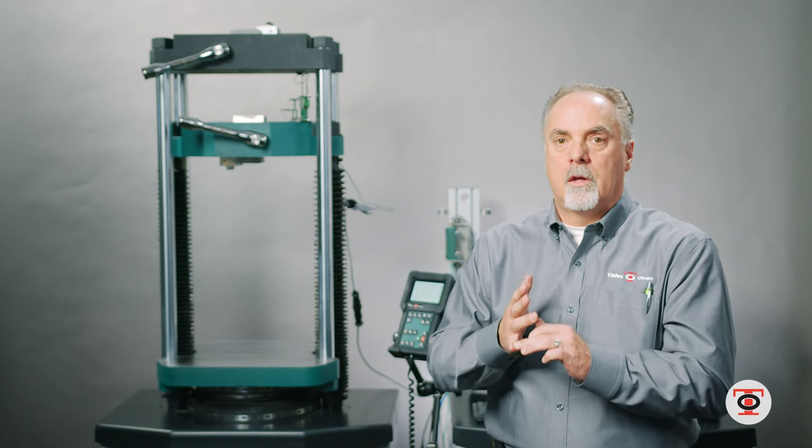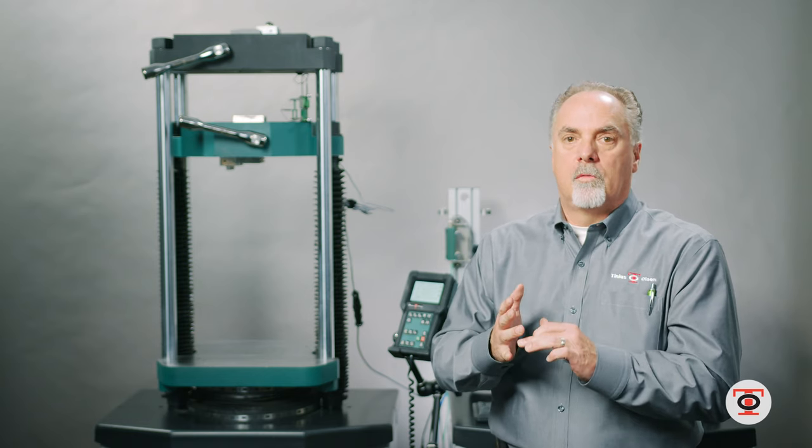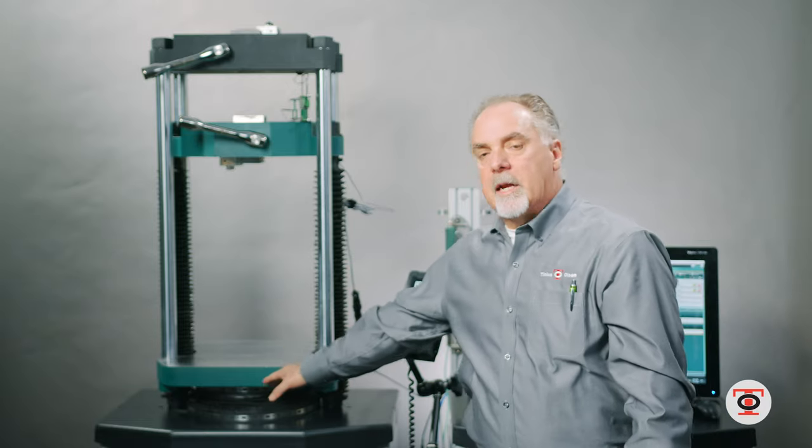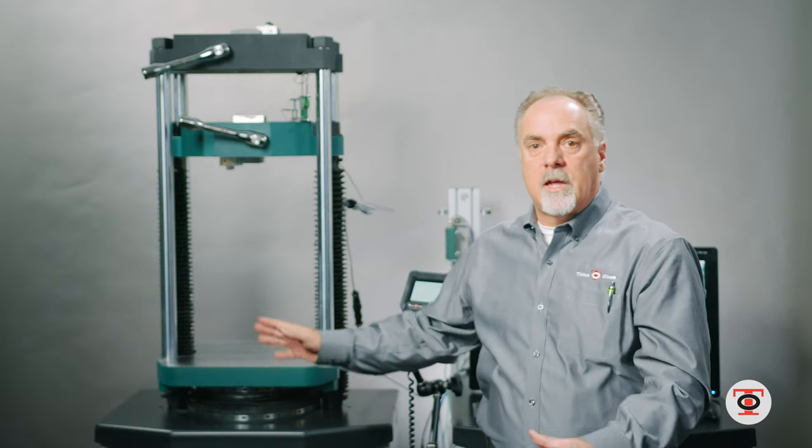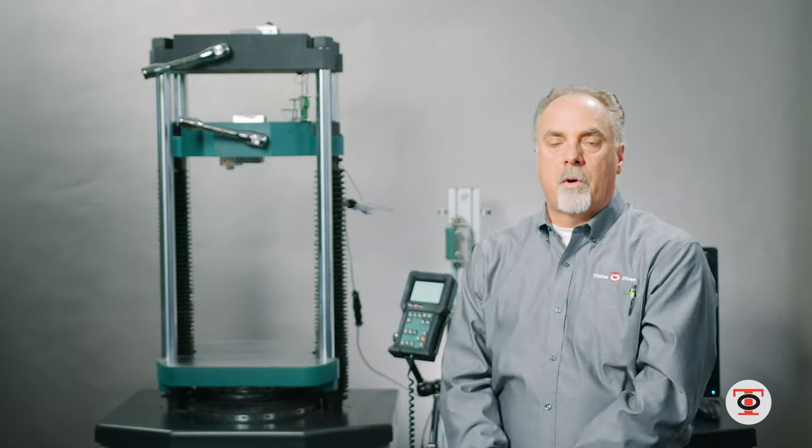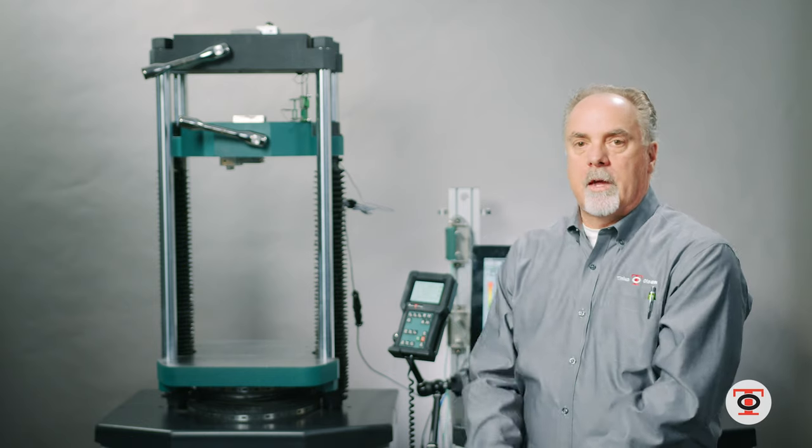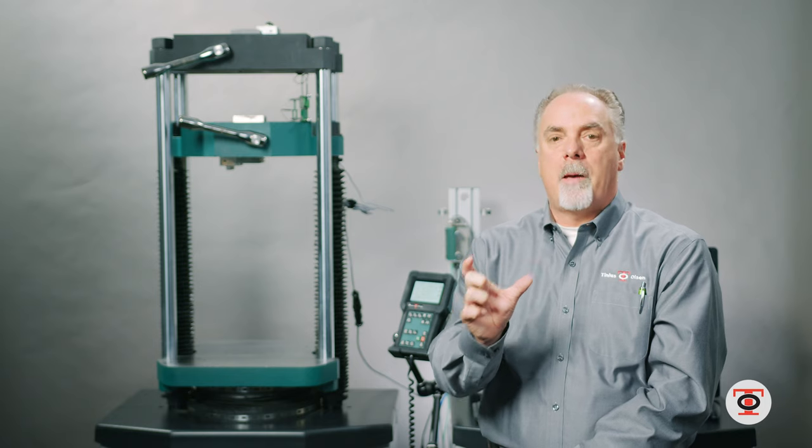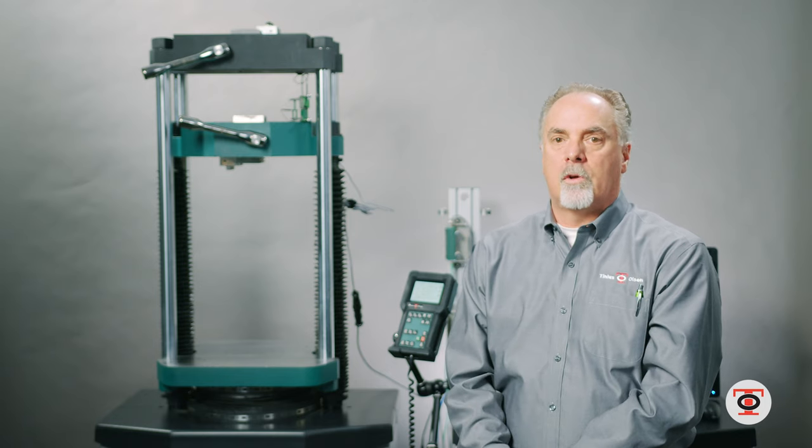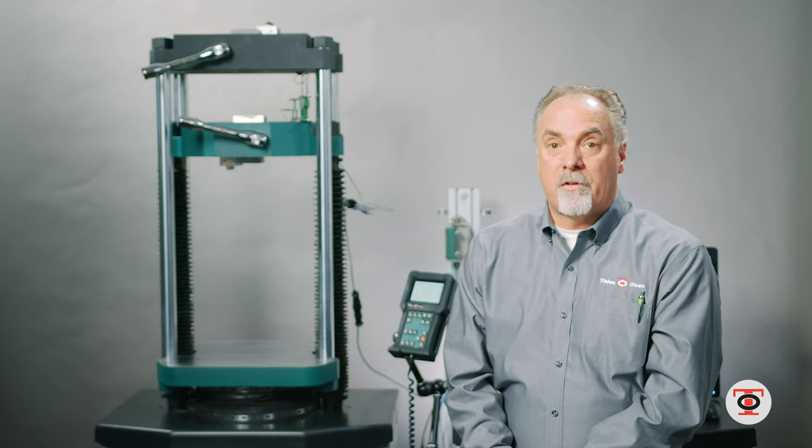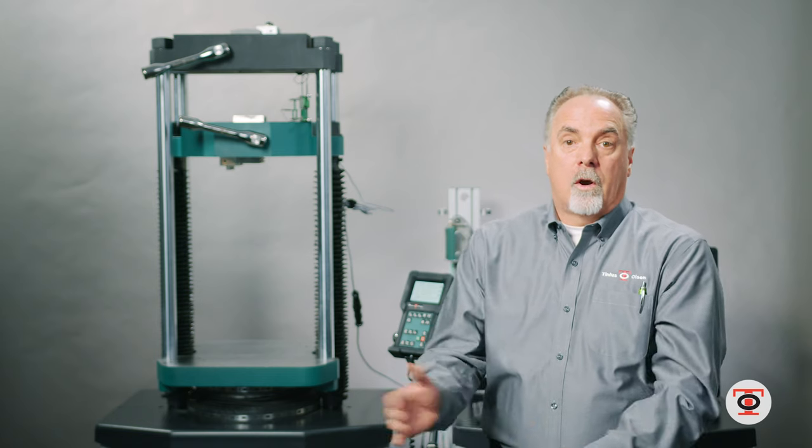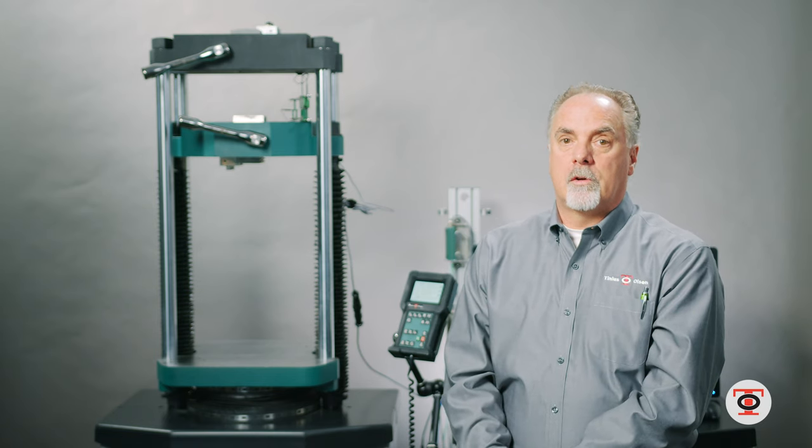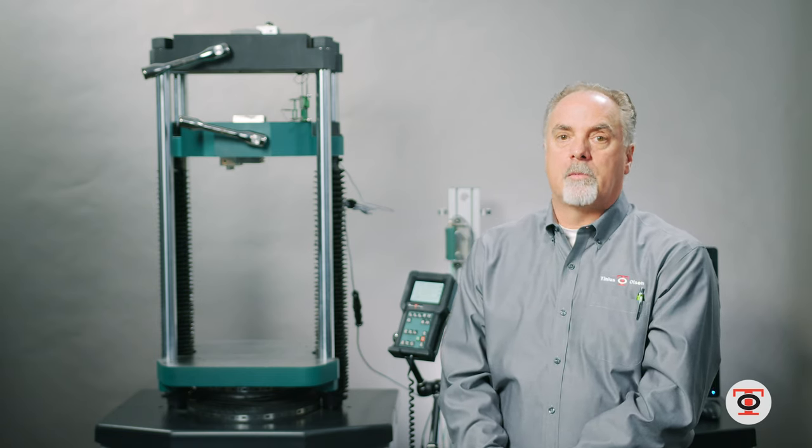There is no load cell on this system, which means if the competitor's machine had a load cell that is underneath the table mounted, you have to tear it apart to get to it. We have a cover on the back of the machine with a pressure transducer that's about that big and that's what reads the oil. It typically can never get overloaded or give you any issues for years and years of dependable service.